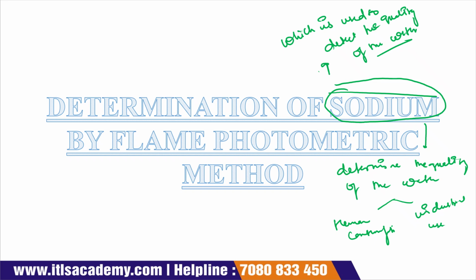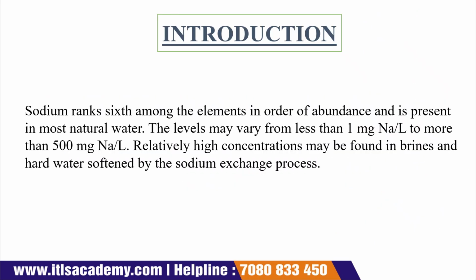Now for the determination of sodium, the method that we are going to use is the flame photometric method. Okay, so let's start today's lecture and come to the first slide, that is your introduction slide. Introduction. Sodium ranks sixth among the elements in order of abundance. Their presence is abundant, and it comes at sixth rank among the elements.